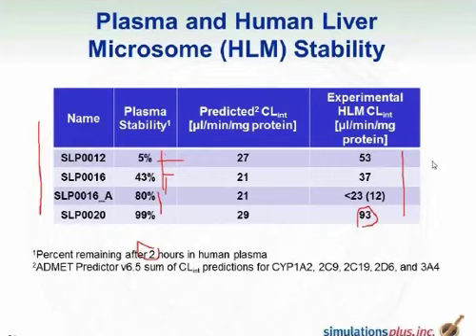And the errors on our individual models, which we're adding up here, are about 0.5 log units, which is a factor of 3. So in fact, it performed pretty much as expected on these predictions. And I should add, these predictions are very hard. I believe they were all in scope, weren't they, Michael? Yes, I think so. Because we have internal flags that warn us if we have a structure whose molecular properties are too far away from our training sets.